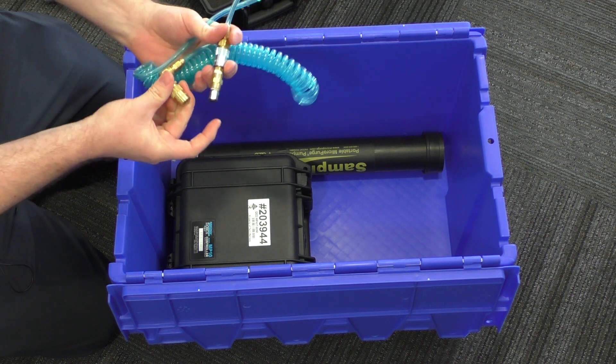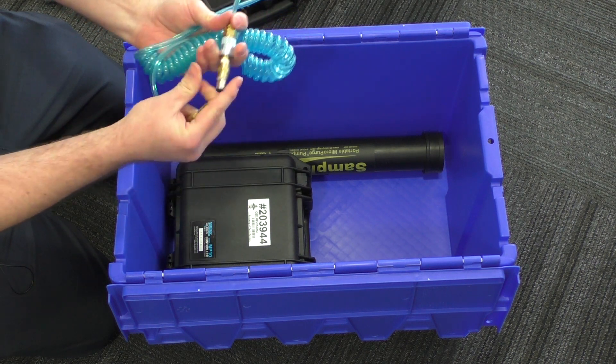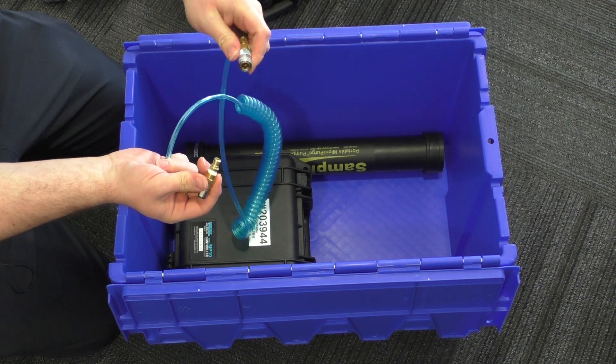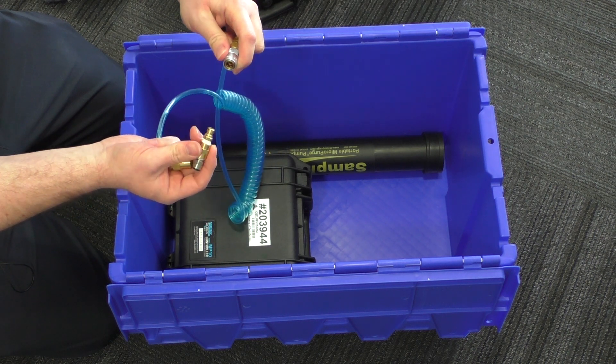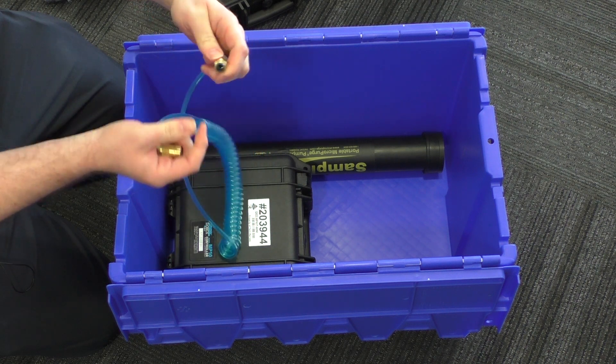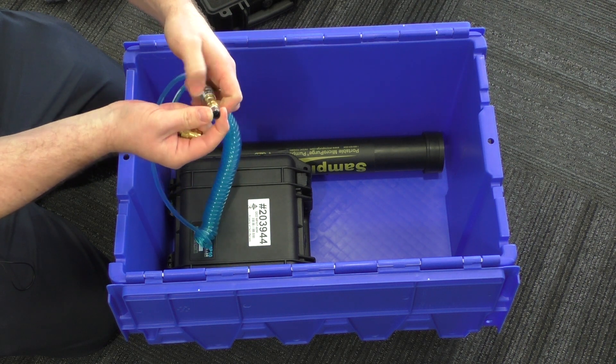Coily hose from the MP10. It can either go onto a well cap fitting if you've got pumps installed or tubing there, or we've got the adapter supplied which goes to your quarter inch tubing.